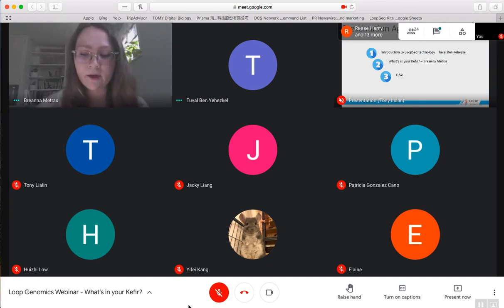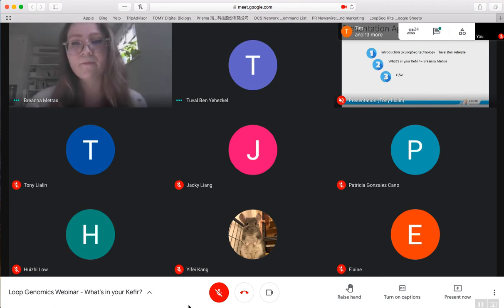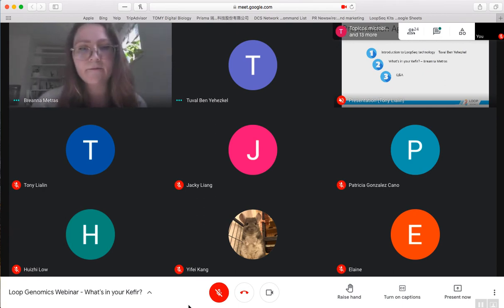We also ran our loop extractions through an 18S to identify potential fungal DNA, and those also came up as nothing. So even though only the first product, I believe it was product A for the pet, claimed Aspergillus fungi, we still hadn't identified any of it. Got it. Great. Thanks for that.